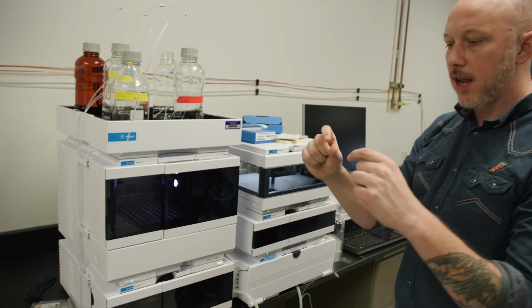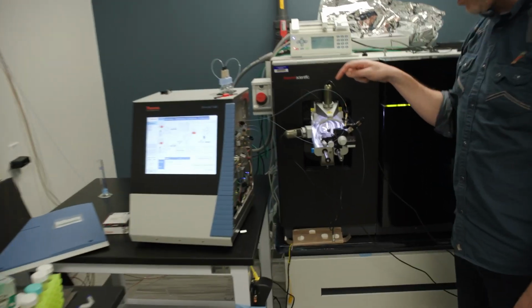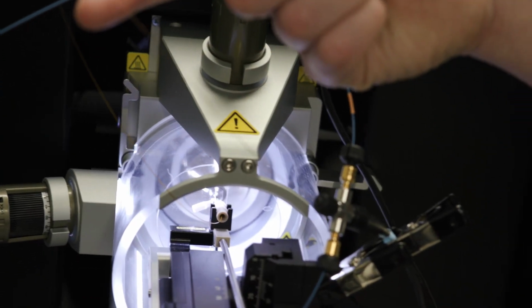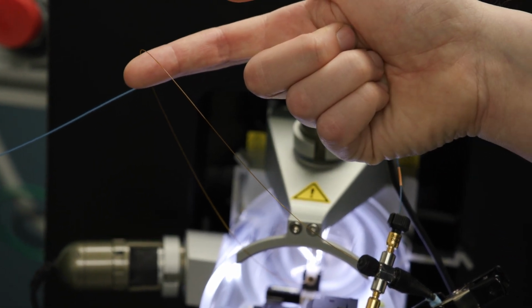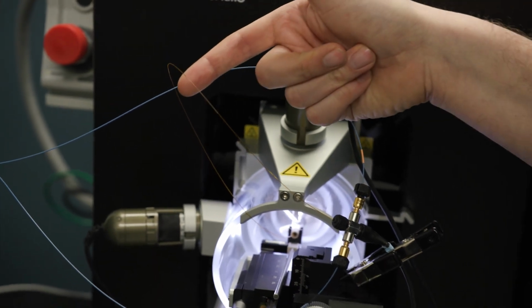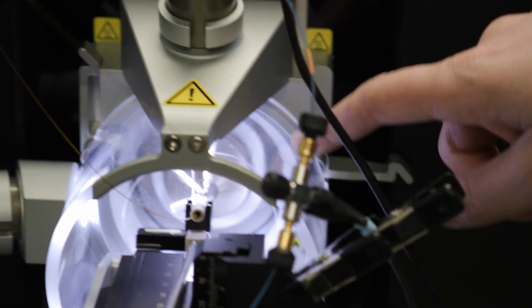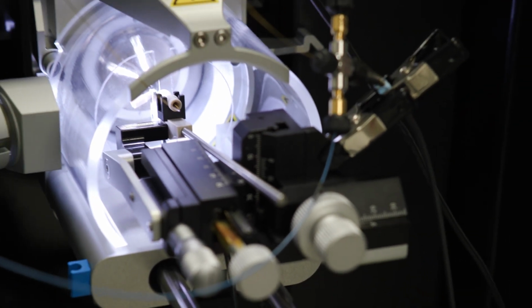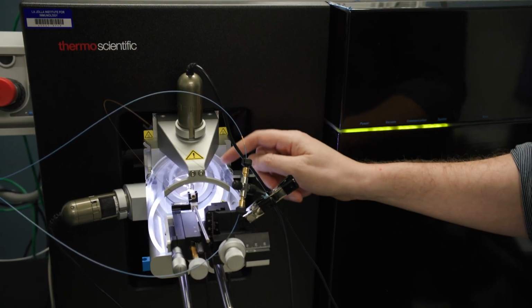And so when we do that, so if you think about that column that we had that we were separating here, the column that we use to separate online into the mass spectrometer is this here, right? So this is a much, much smaller separation column that we're doing. And we call this online chromatography. And what this allows us to do is take that fraction that still has a lot of material in it, has a lot of different chemical species in it, and they will again separate differently here, and they'll come out a few things at a time. And as they electrospray into the mass spectrometer, we can apply a really high voltage to the liquid that then allows the very small droplets to desolvate and then be pulled, the gas phase analyte will be pulled into the mass spectrometer.